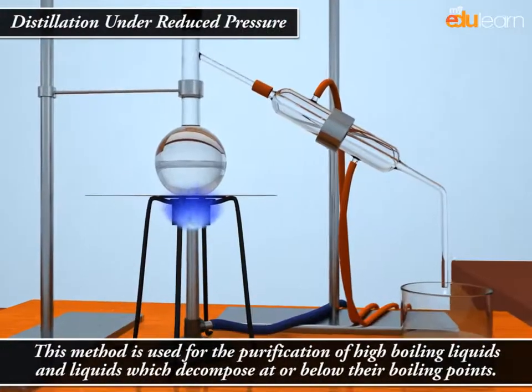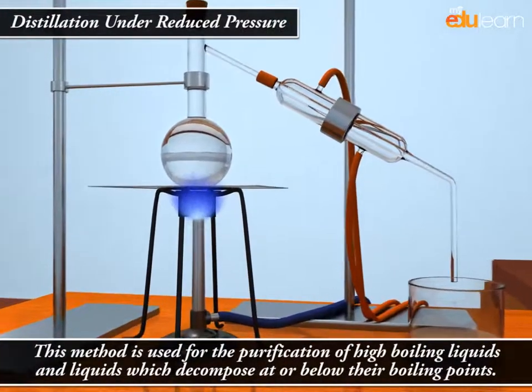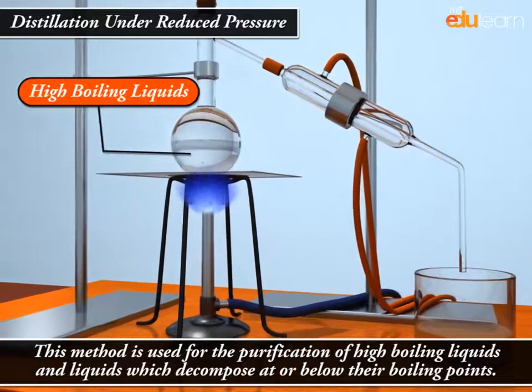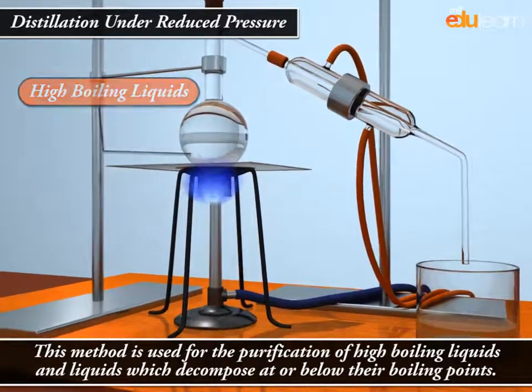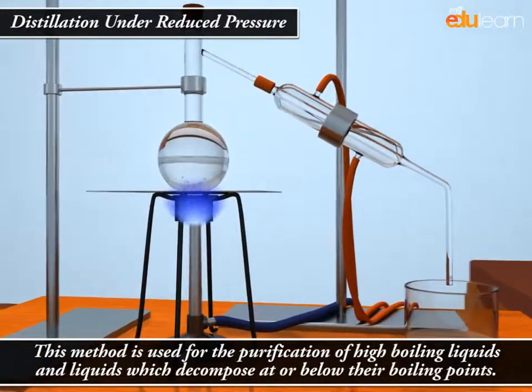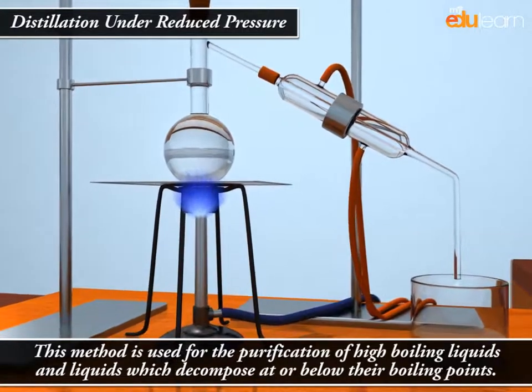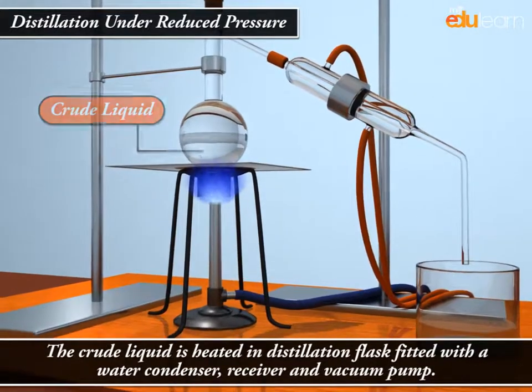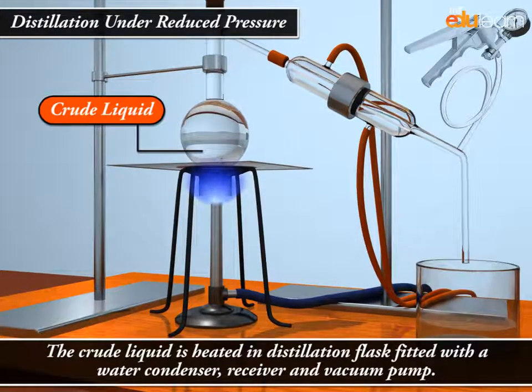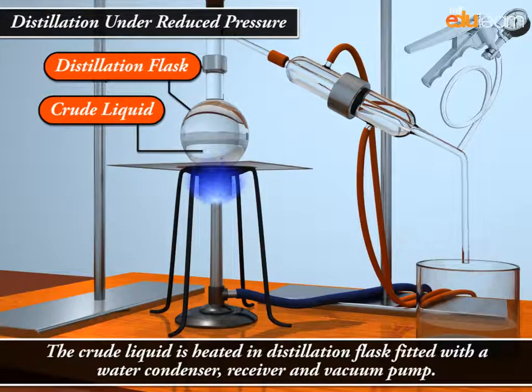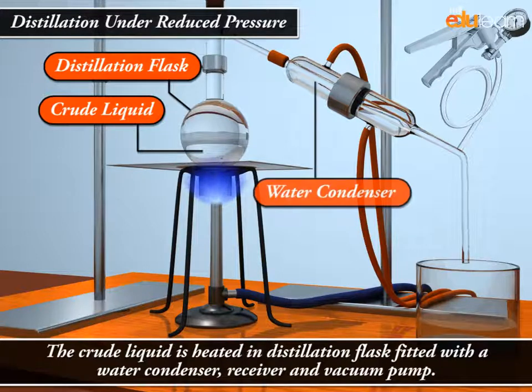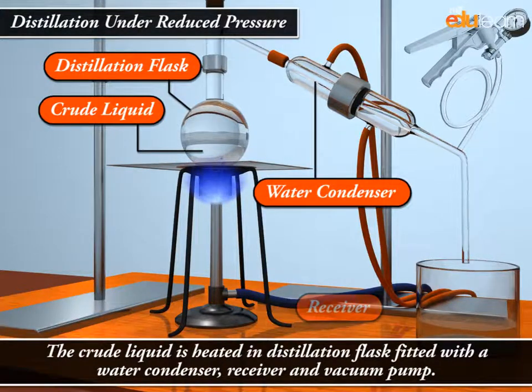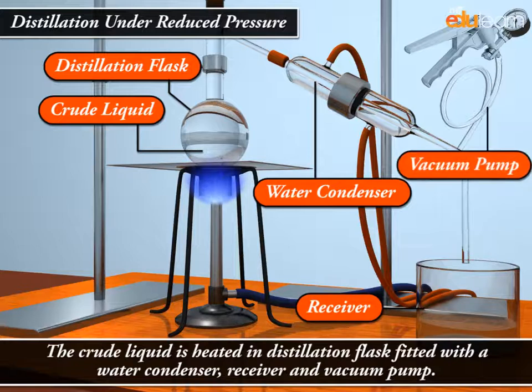This method is used for the purification of high boiling liquids and liquids which decompose at or below their boiling points. The crude liquid is heated in a distillation flask fitted with a water condenser, receiver and vacuum pump.